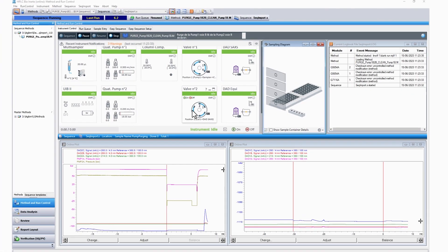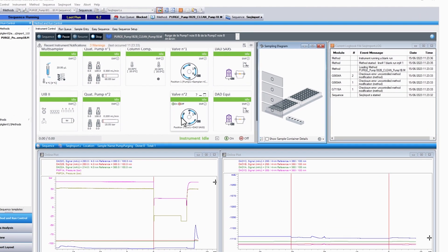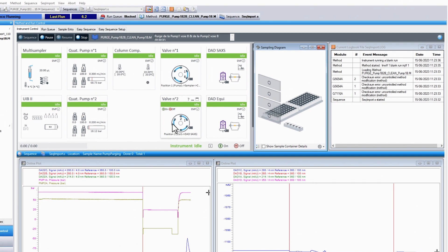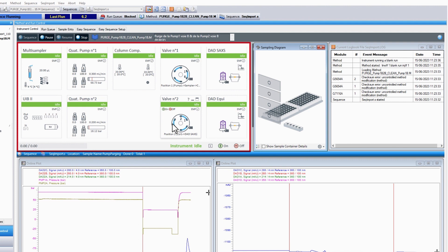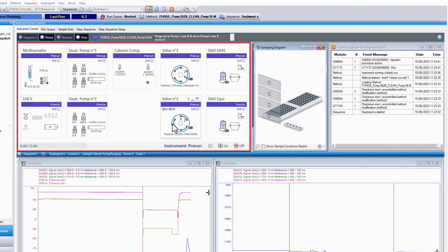At this moment, all the information about the columns which have to be purged are sent from the database to the HPLC software. You can follow the purge process on the HPLC ChemStation screen.